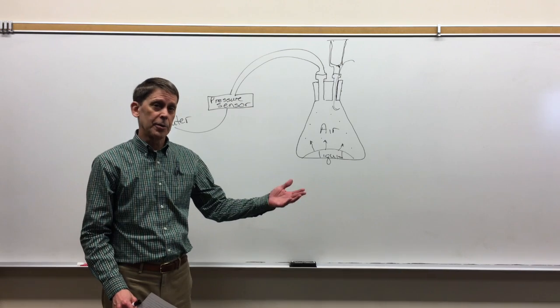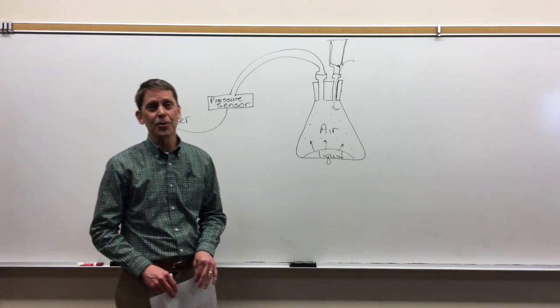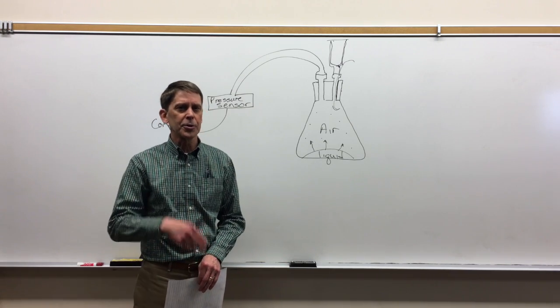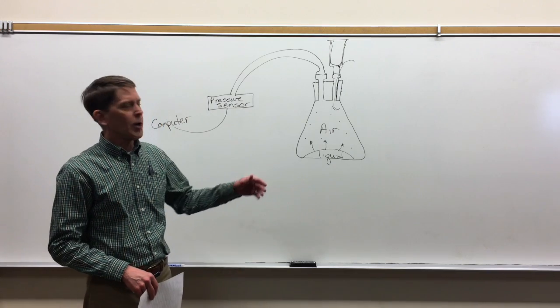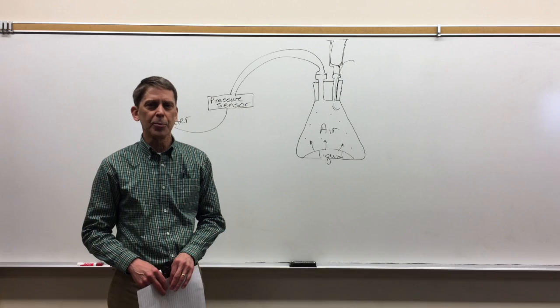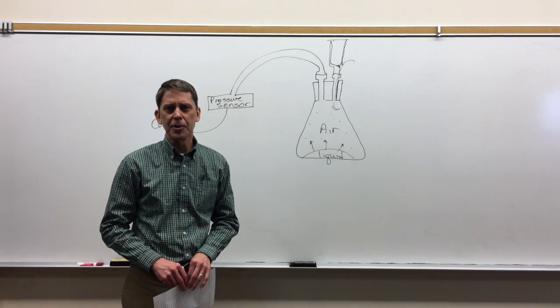Once you've gotten the vapor pressure, you will use your knowledge of the intermolecular forces for those different liquids that we're going to be doing in this way. You'll use your knowledge of those intermolecular forces to rationalize the order of the vapor pressures that you get experimentally. So that's an overview of what we're doing in the lab this week.